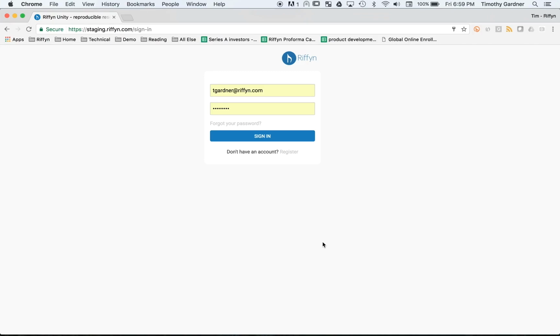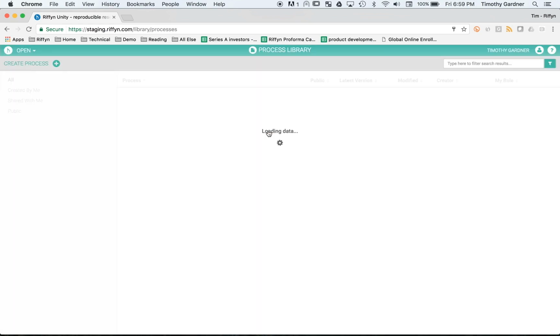Welcome to Riffyn. In this video, we will illustrate Riffyn's use for a drug metabolism study in large animals. We will begin by logging into the Riffyn cloud via our web browser. This takes you to Riffyn's process library.